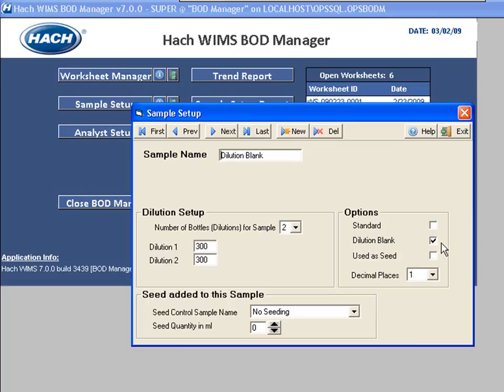What that's telling the system is that when we run bottles and we say this is the dilution blank sample, standard methods criteria is going to be applied to those bottles, but we're not going to treat it like a normal BOD. We're going to apply the rules that apply to a dilution blank, which is things like you can't drop by more than 0.2 during the five days.